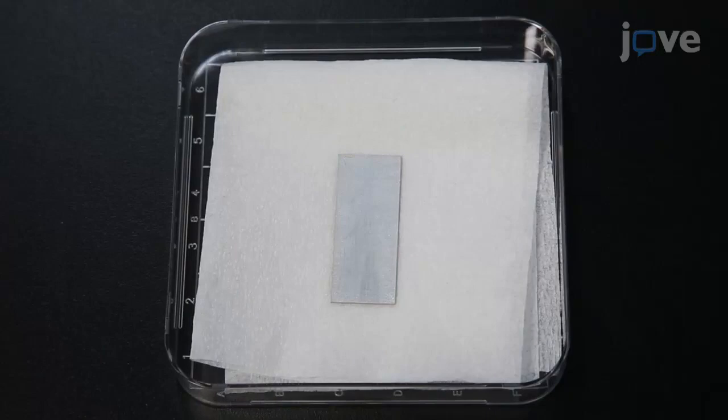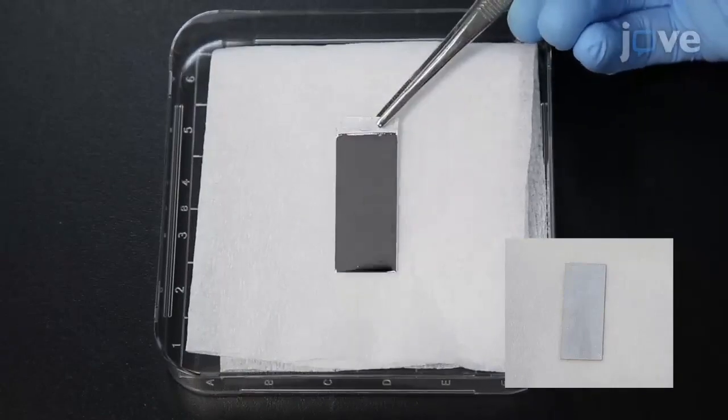After applying a voltage of 20 volts, the aluminum plate goes from having a rough, lusterless surface to having a mirror-like surface, silver in color.